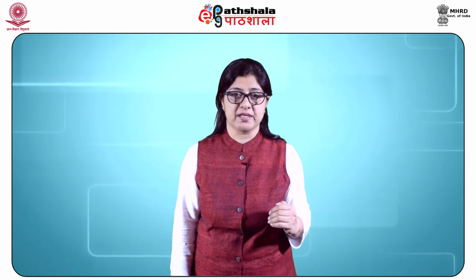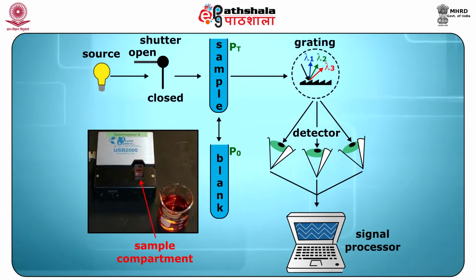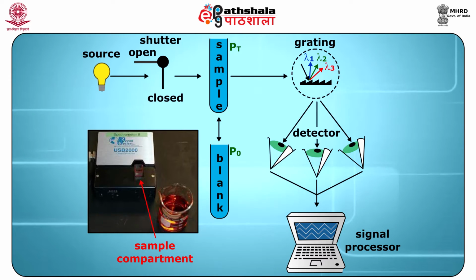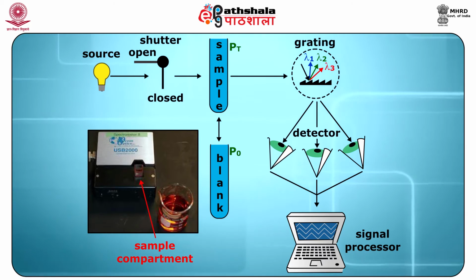range of wavelengths. A diode array spectrometer is a small and compact instrument as it contains just a grating in place of a full monochromator. The signals are then processed by a signal processor and the spectra is obtained.